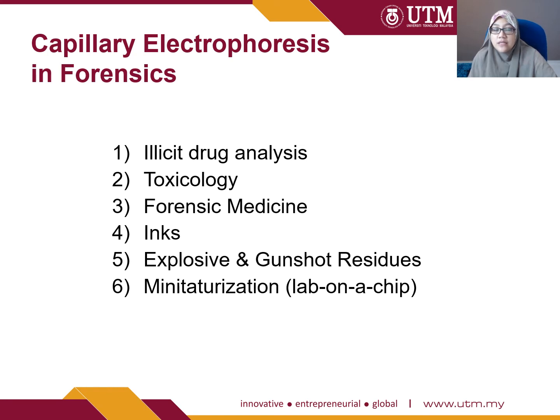So this gives a bit of advantage to CE techniques. And also one of the examples is in GSR analysis, whereby CE is very good to look at heavy metals that originate from the primer. So in gunshot residues, people have used capillary electrophoresis to separate the heavy metals.